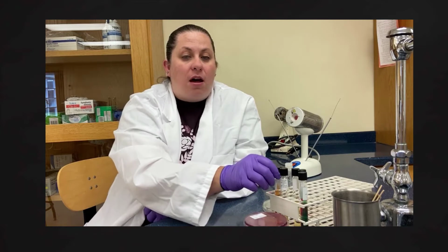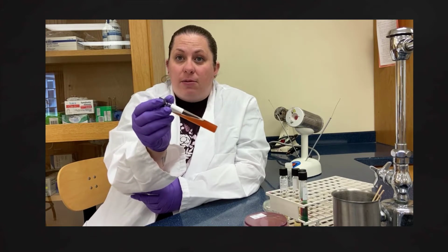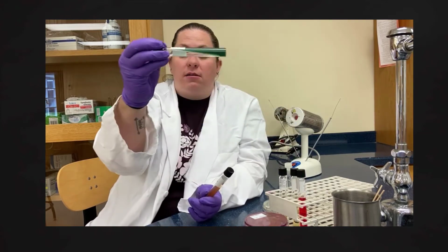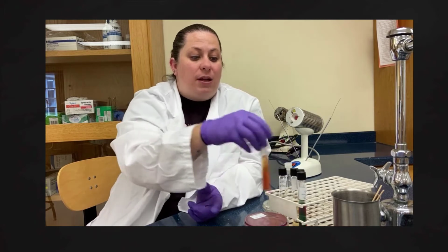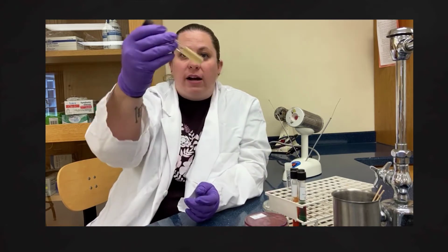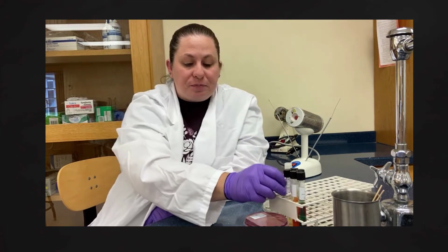We can also put the agar into test tubes and create what we call a slant. What they do is they pour the agar in here when it is hot, and before it solidifies, they put it at a slant. And so you can see that there is a slant here. We have one also here where it's at a slant. We also see they can put it into a test tube where it's a solid, and this is called a deep. All right, and so we can see that it's a deep in this case.